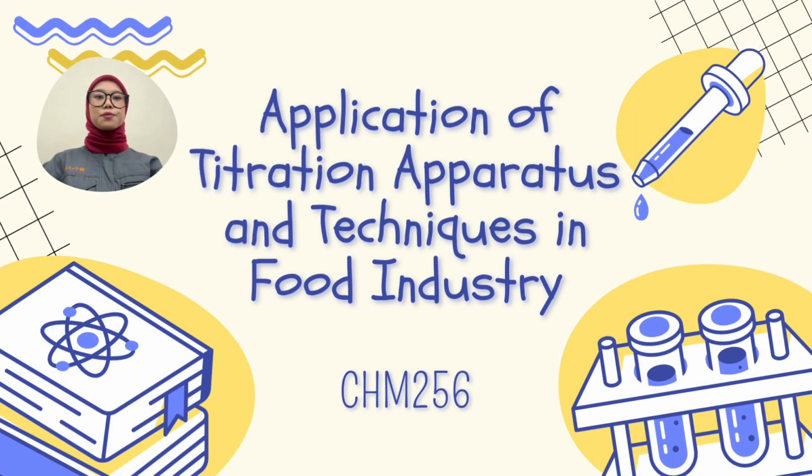Today we would like to present our topic entitled Application of Titration Apparatus and Techniques in Food Industry. As we saw in the opening demonstration, different fruit juices have different acidity levels. Have you ever wondered how the manufacturers ensure that every bottle of juice has a consistent taste, quality, and safety before it reaches consumers? The answer lies in analytical chemistry, where laboratory apparatus and proper analytical techniques are used to determine the acidity of fruit juice accurately.